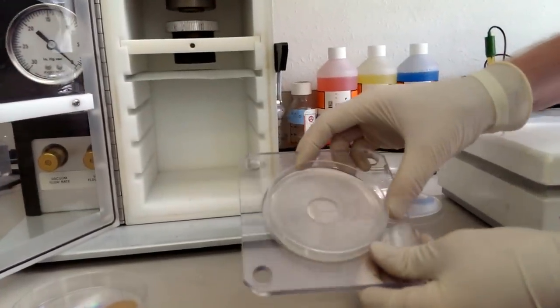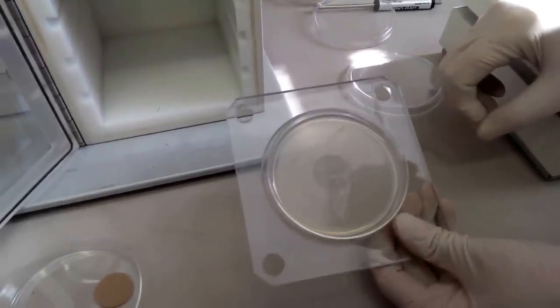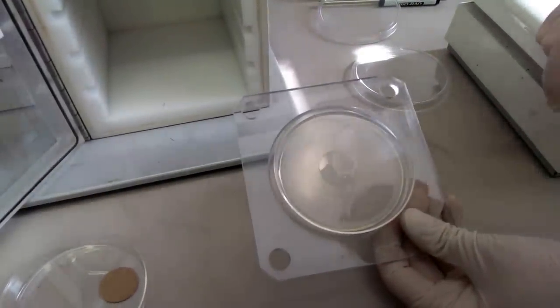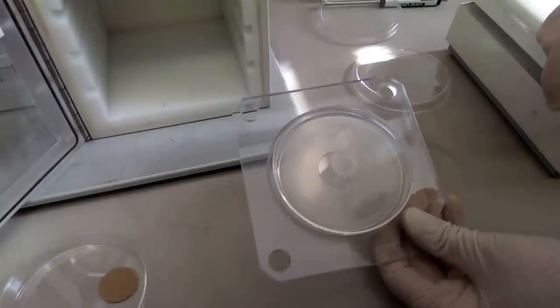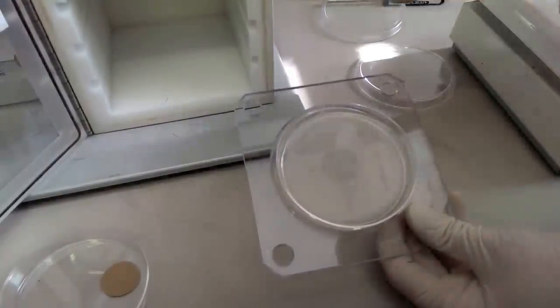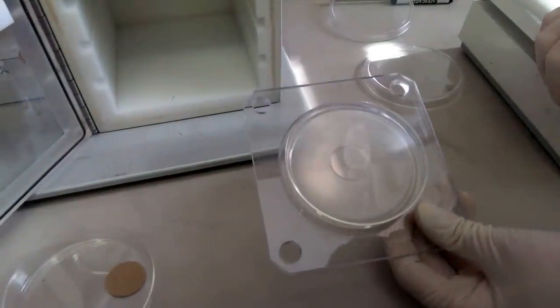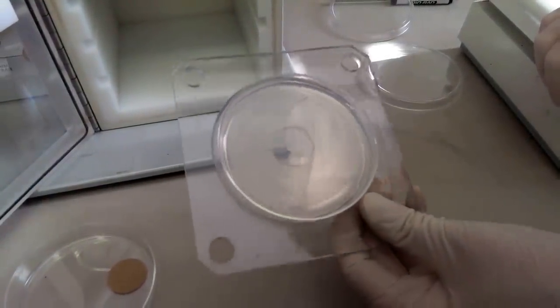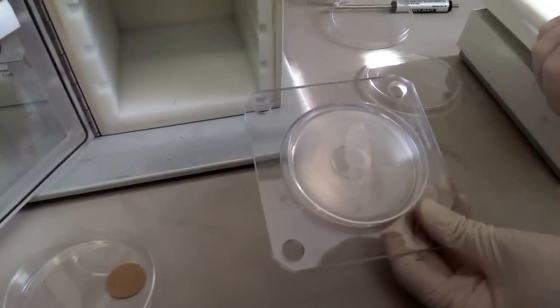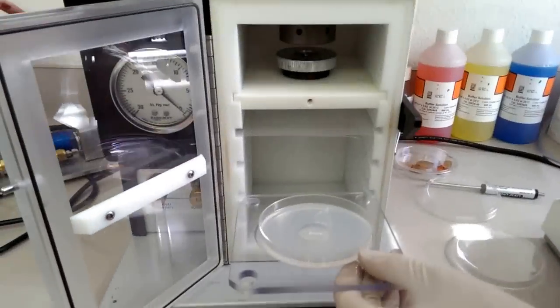So here is just an onion peel. It's literally just an onion that we bought from the grocery store, and then we cut it out and took a peel from the inside. It's useful to test run gene guns with because, one, it's a flat layer of cells. You can test to see what the pattern is that you're bombarding. Two, they're clear, so you can see things much easier. And then three, onion cells are pretty decent sized, so you can see them fairly easily under a microscope. So we'll put that in here.